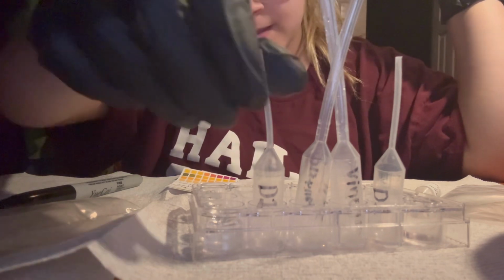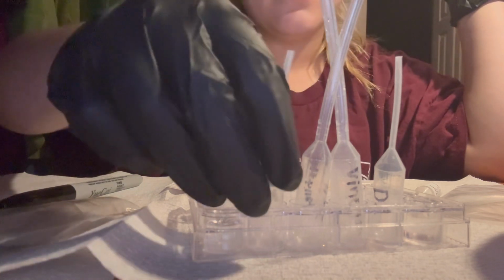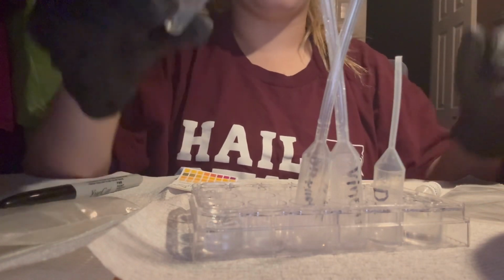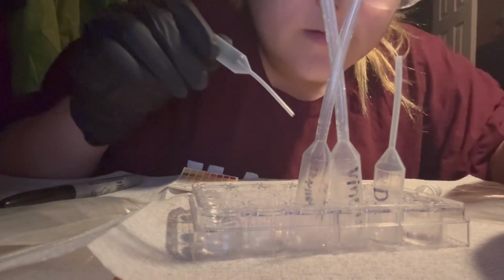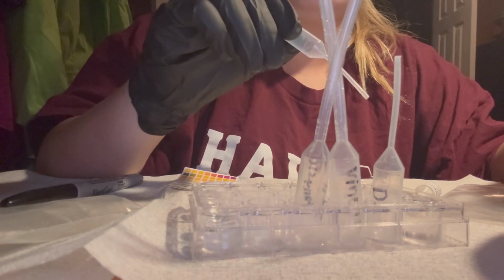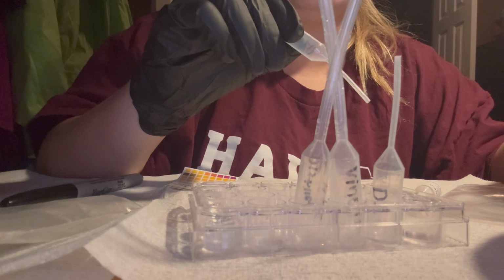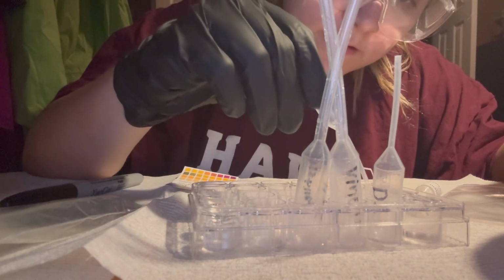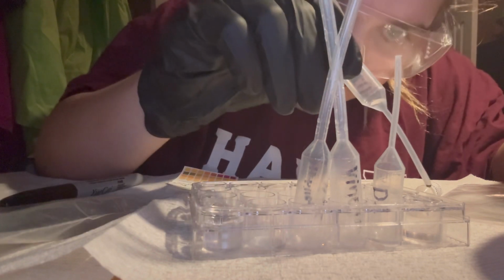So here's my pipette, it's labeled D1. And let's see, add 2 drops of the 0.1 molar HCl into the buffer in well A1. So 2 drops of this into A1.